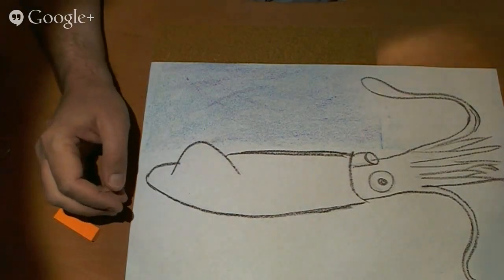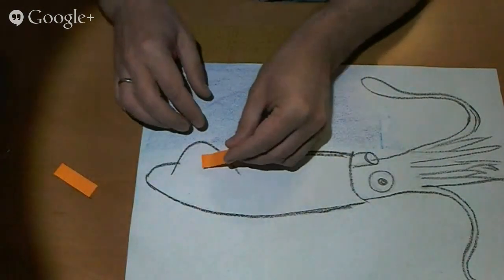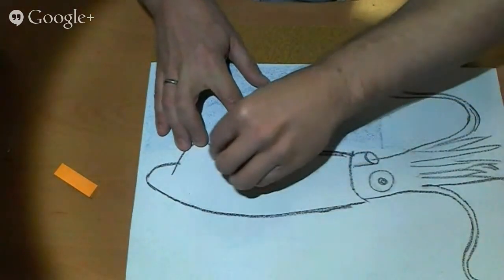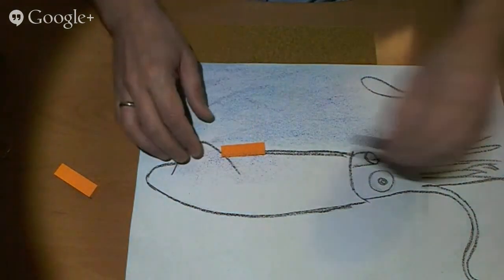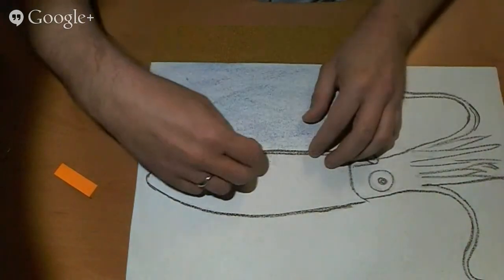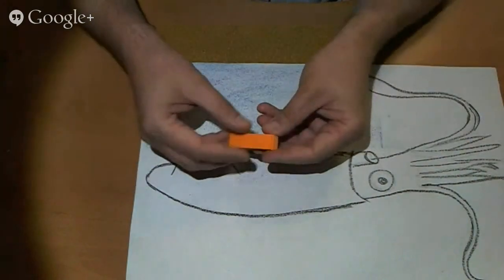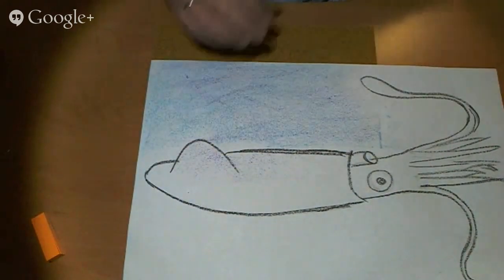You can teach them to label. So here's a quick trick for labeling. If you want to have them label that this is the fin, you could put this right over here, and then they color over it, color all around it to get the chromatophores on there. Color the ocean down here as well. And when they pull this up, it still leaves a little bit of space for them to write in the word fin or however they want to write their label. So these are just little sticky notes. You can get those anywhere and put them on there. And that will leave a space blank for them.